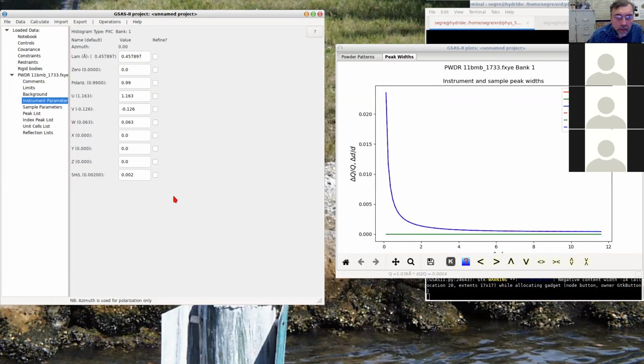If you were taking data from the powder diffractometer that we have here in the synchrotron center down in room 50, then you would notice that there's Gaussian and Lorentzian components to it because it is a laboratory instrument. The geometry is different. This, if you recall, is in the Laue geometry.